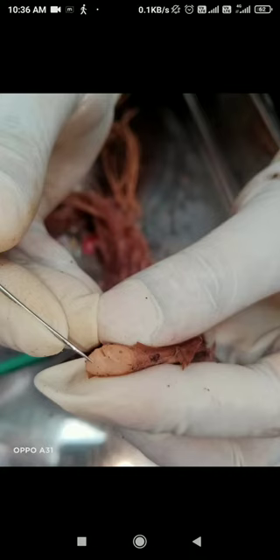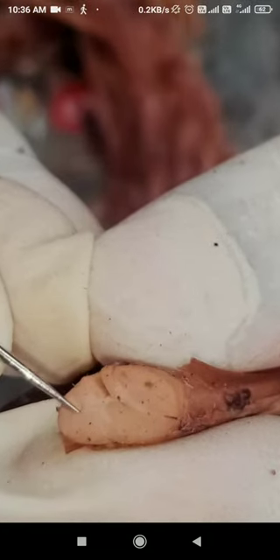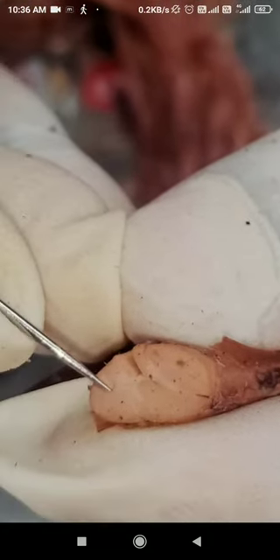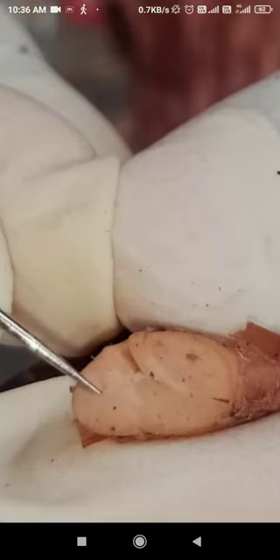This is a cut section of spinal cord. Clearly we can see the gray matter — the ventral gray horns, which are large and bulbous. They are projecting forward but not reaching the surface, not reaching the anterior lateral sulcus area.